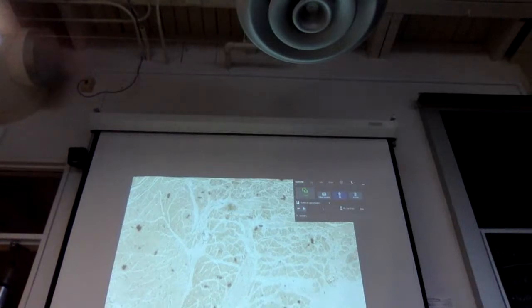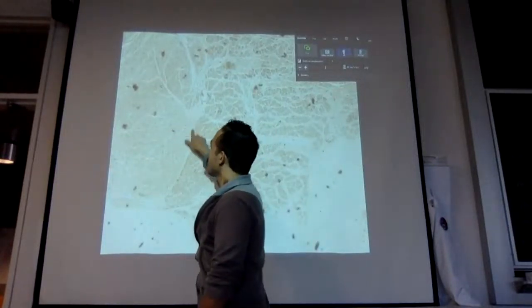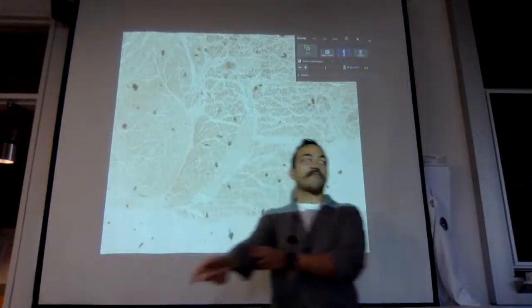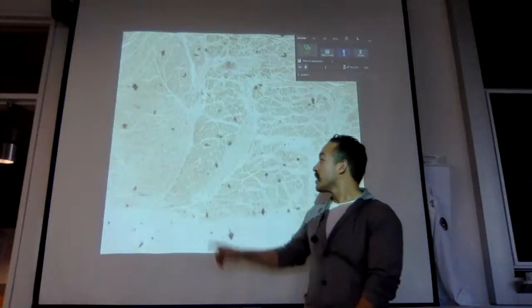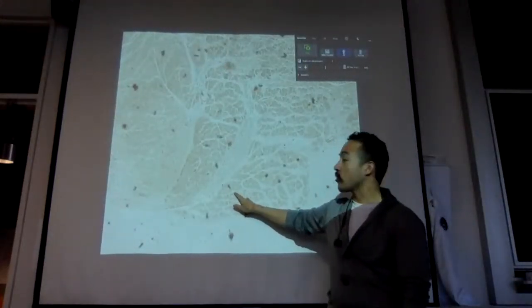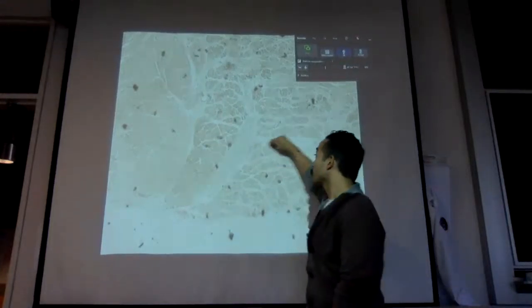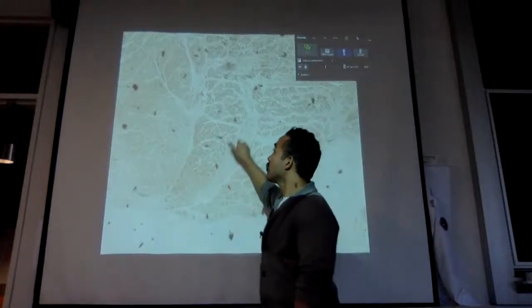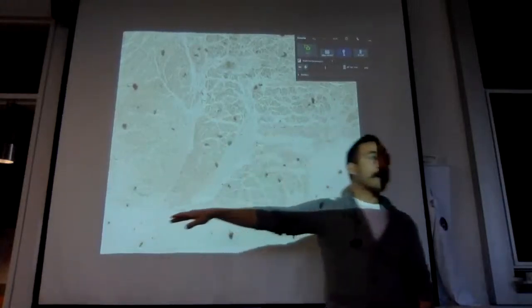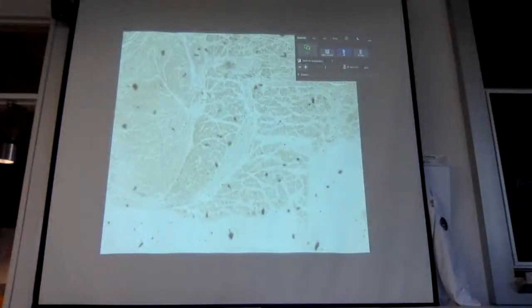Question 5, what is the tissue that's surrounding right here called? Perimysium. Each one of these little things, those are muscle fibers. So surrounding each muscle fiber is endomysium. Surrounding the fascicle is perimysium. Surrounding the whole thing would be epimysium.